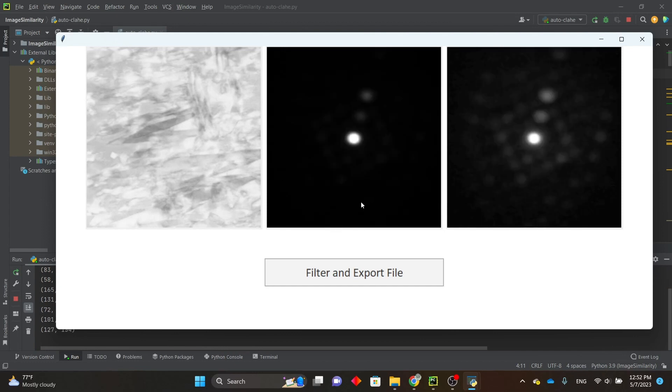Once you're done previewing, you can click on the filter and export file button, and it'll start filtering the entire data set.